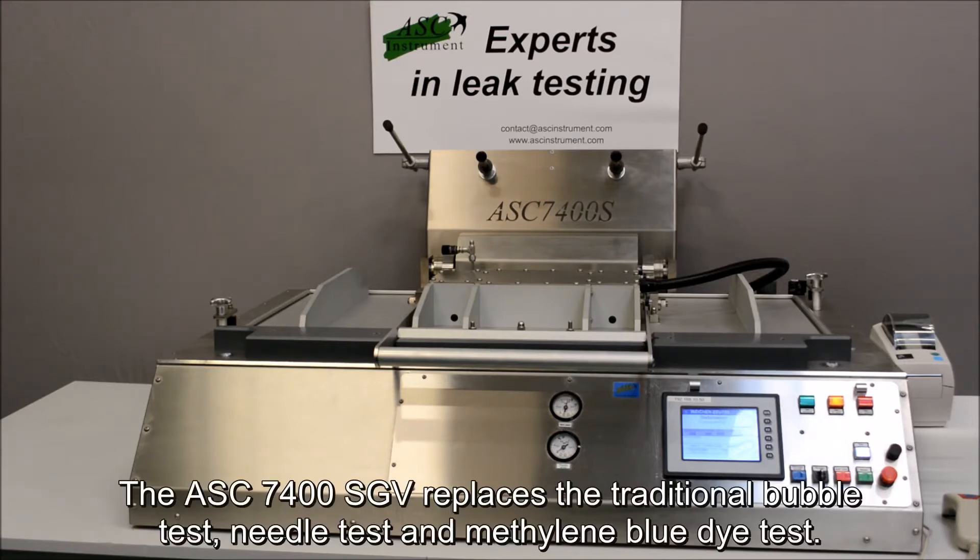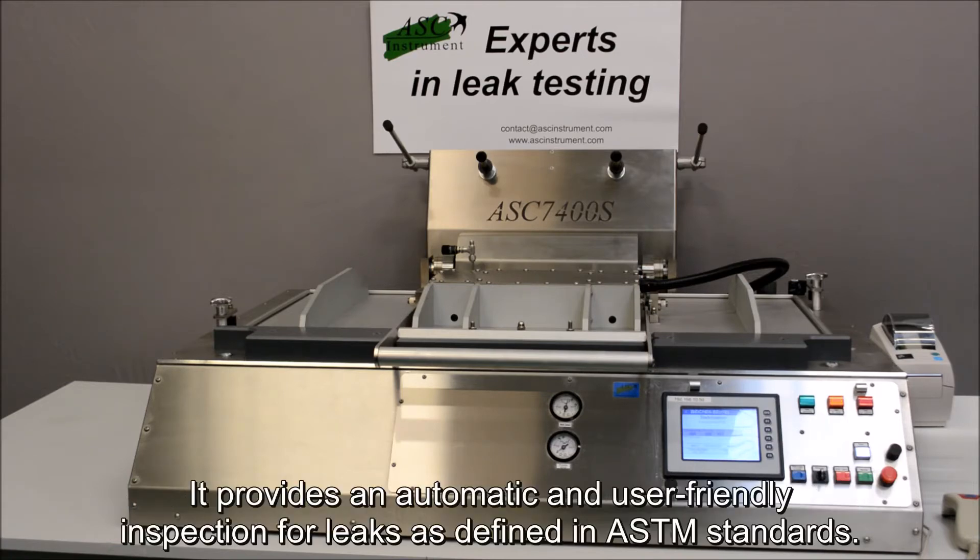The ASC 7400SGV replaces the traditional bubble test, needle test, and methylene blue dye test. It provides an automatic and user-friendly inspection for leaks as defined in ASTM standards.